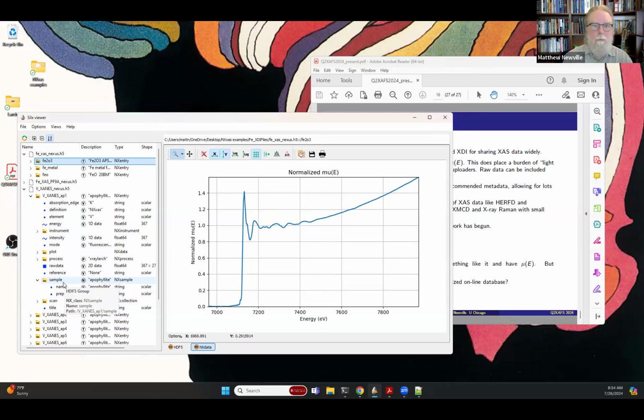Okay, next one, Konstantin. For post data processing, what are your thoughts on updating existing NeXus fields in the same file versus creating a new NeXus file, maybe linked to the raw data? Yeah, so I'll defer to Wout and the people at ESRF on this, who think about this a lot more than I have done in the past. That's a good question.